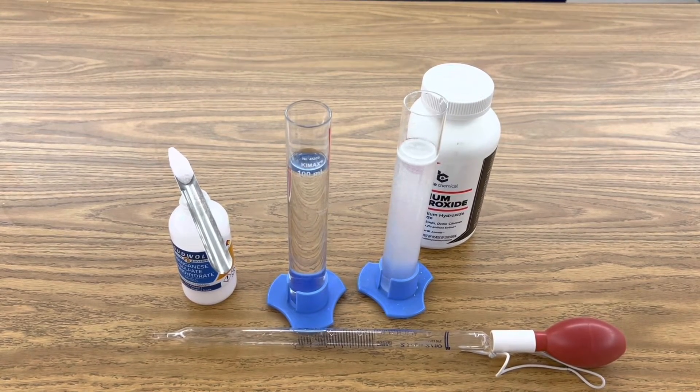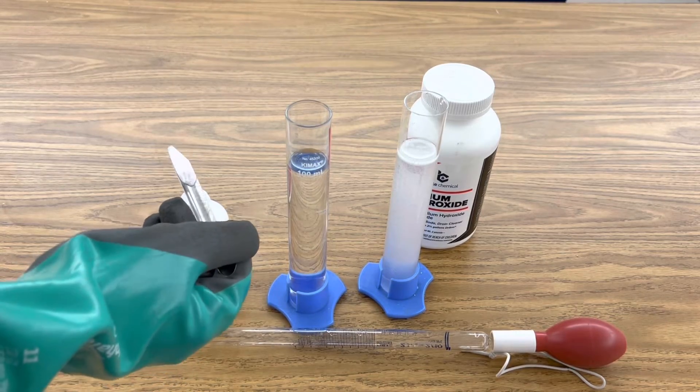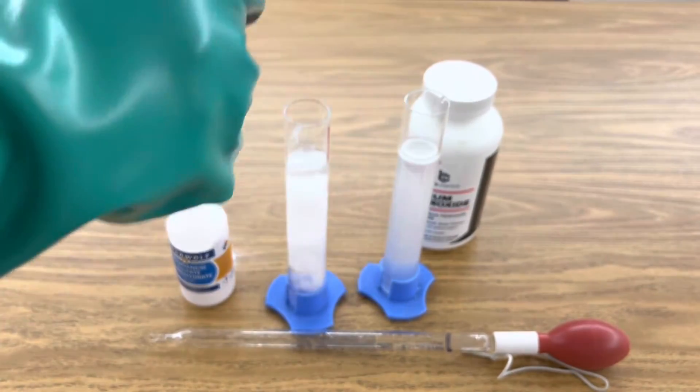Now add four grams of manganese sulfate to your second graduated cylinder of 100 milliliters of distilled water and stir it until it becomes aqueous.